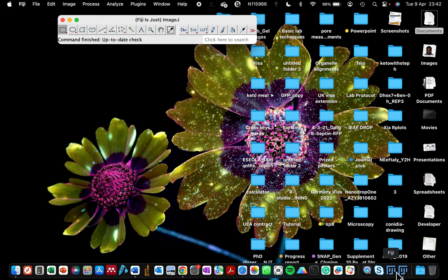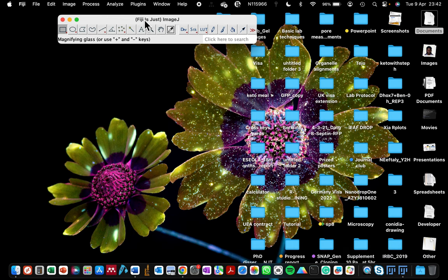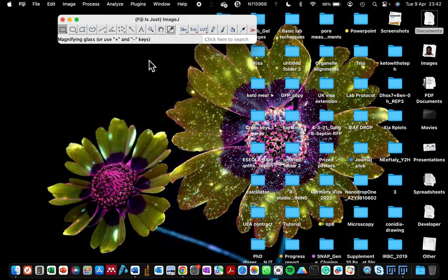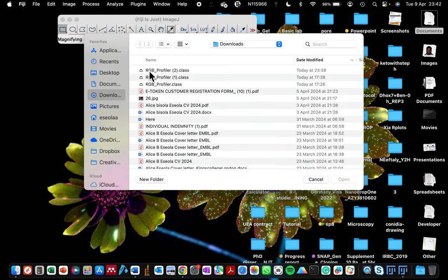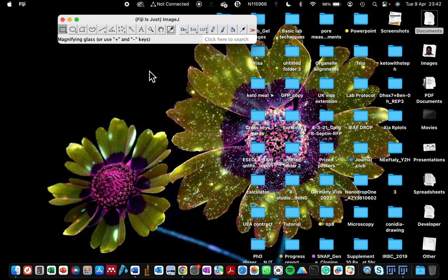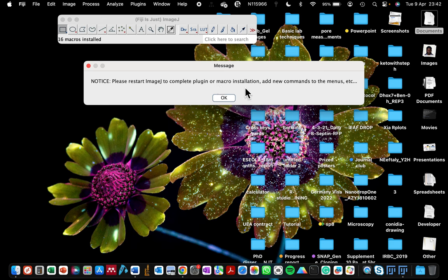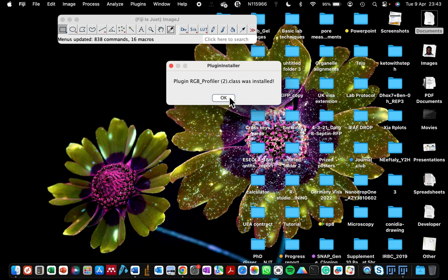Now if I go to plugins, install plugin, and repeat the process we repeated earlier, we are not going to be having that problem anymore. As you can see, it says please restart ImageJ to complete plugin or macro installation and add new command to the menus. If I click okay, you can see it says here RGB profiler class was installed. That is how to solve the problem with the plugin not being installed on your MacBook or Windows PC.